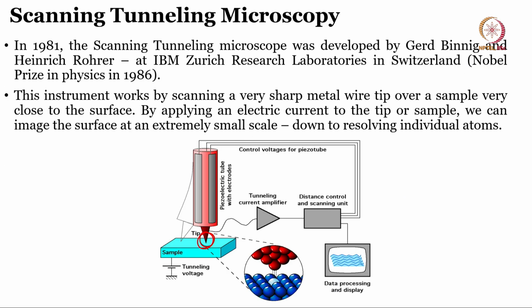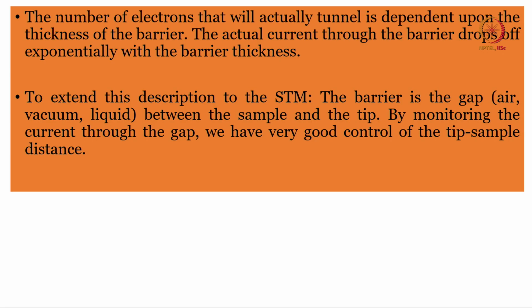Now, let us see here. Between the sample and the tip, there is a gap, okay. It is not touching the sample. This is the sample and this one is a tip, just like we are scanning it, okay. So, now let us go back.